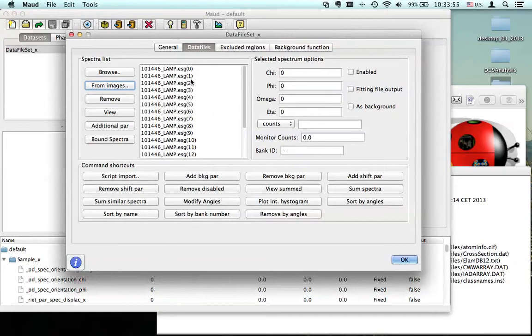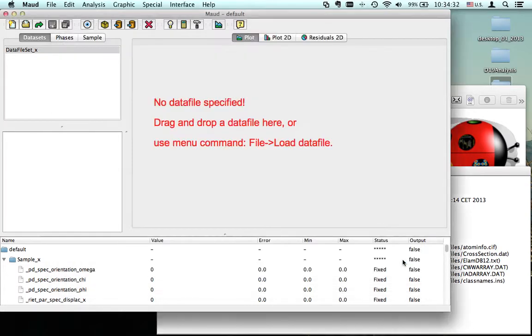Don't save ImageJ. Now you see the first one at minus 45 is not enabled, because it didn't have sufficient data, so it's out. The second one at minus 40 is enabled, so it's in. The last one not, and this one yes. So minus plus 40, that one is a little bit out of our border. So let's see what we get.